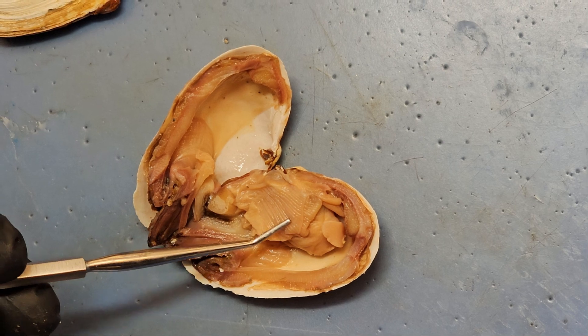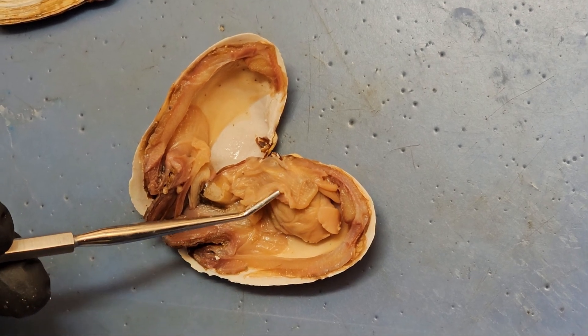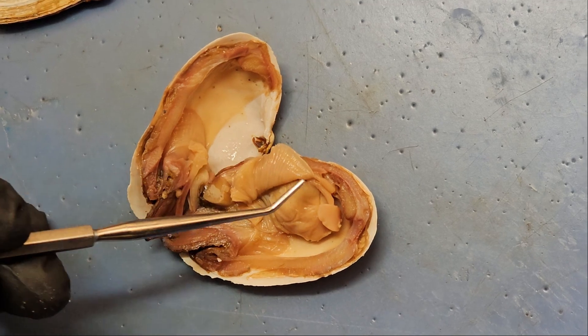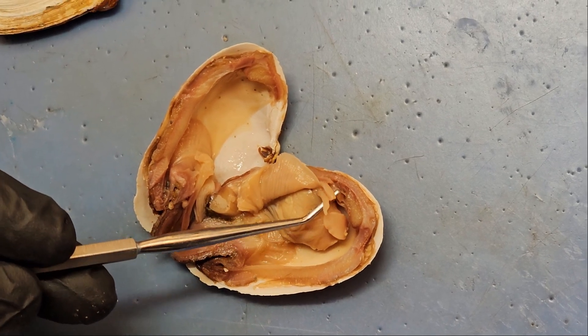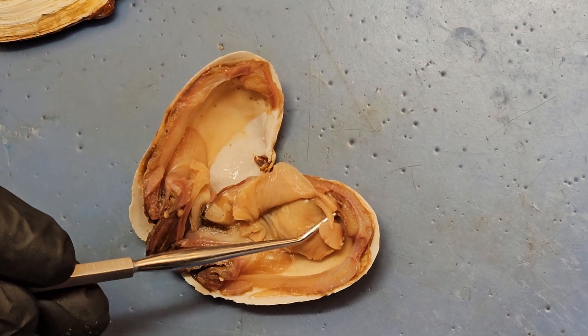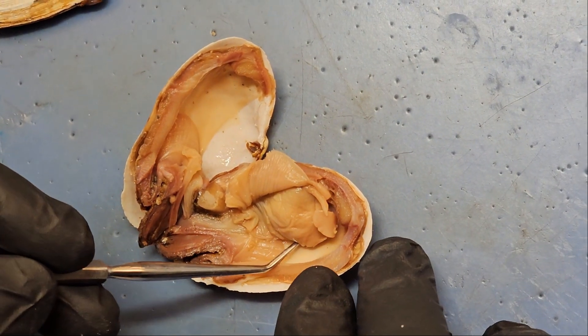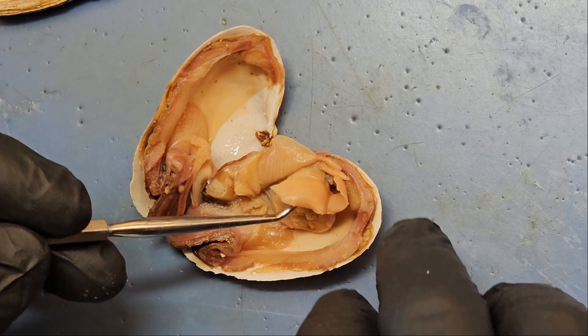These striped things are the gills. We have two sets of gills on the left and two sets of gills on the right. If you flip that up, you can see these tiny little things here are labial palps — they help to put food in the mouth.